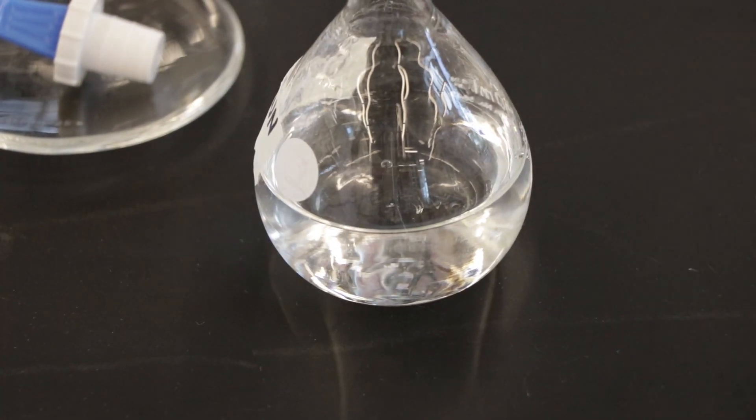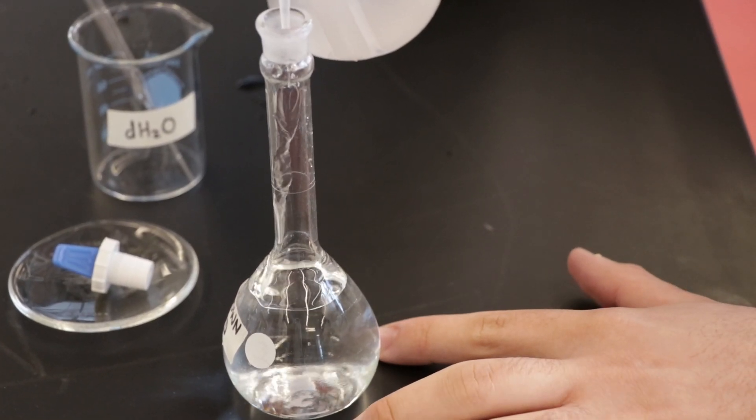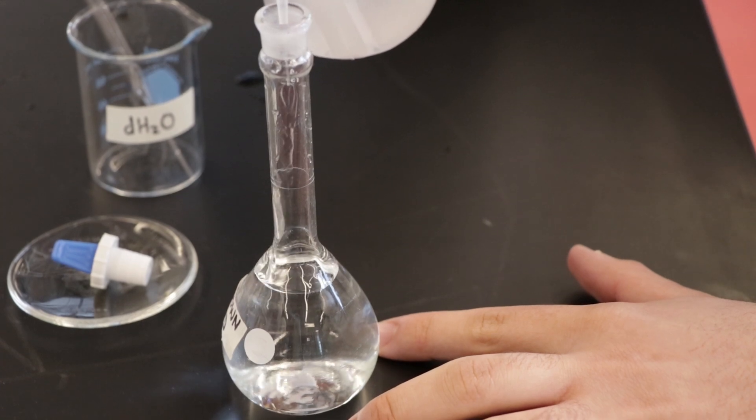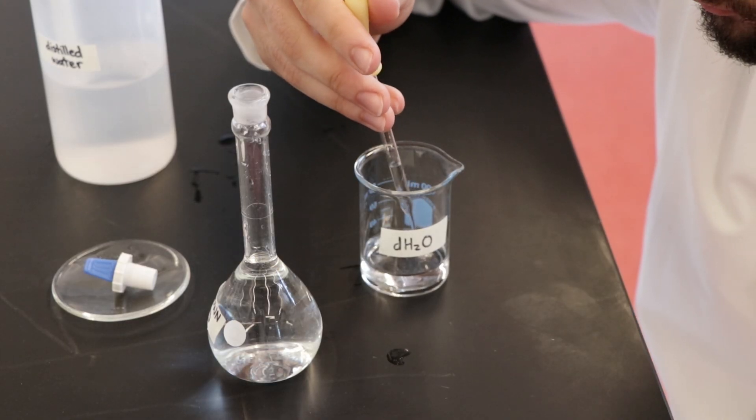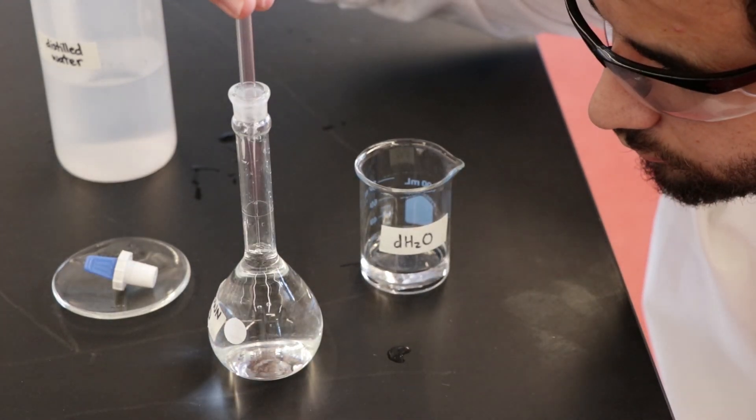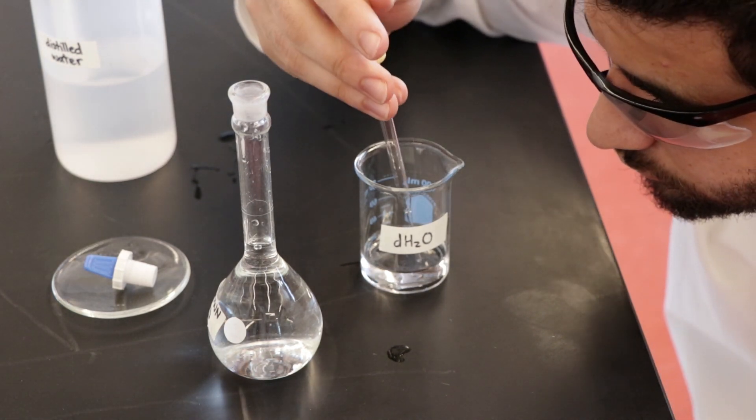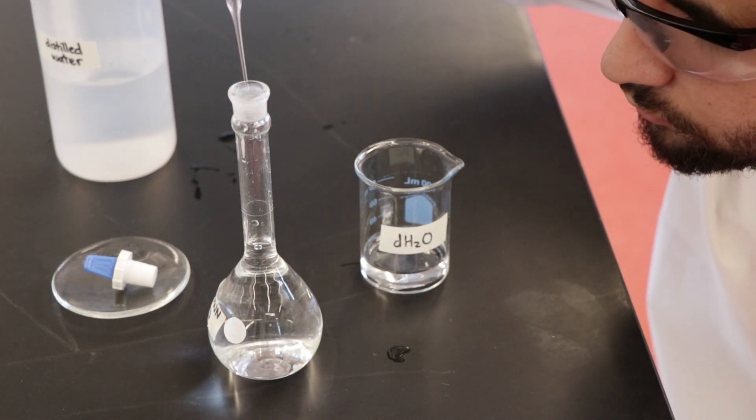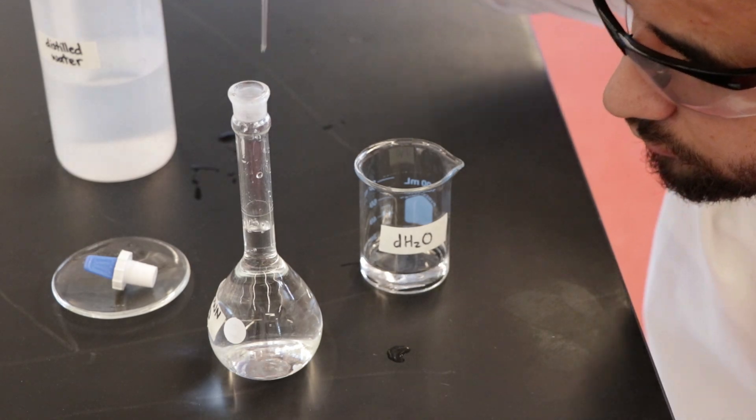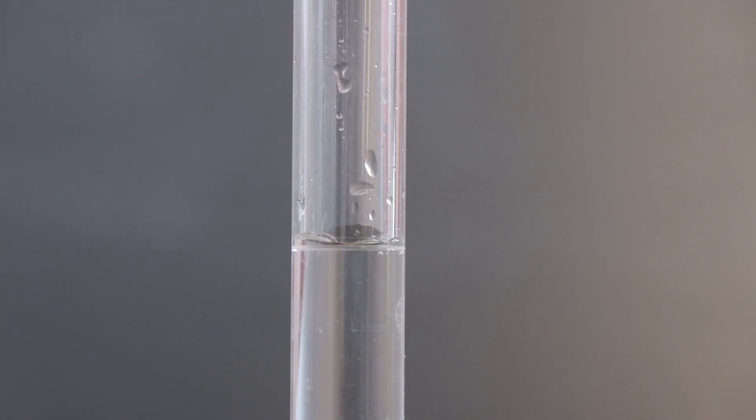Once all the solid is dissolved, fill the flask to the mark. You should use a wash bottle to add water until the bottom of the neck and then use a disposable pipette to carefully fill to the mark. Remember to be extra careful at this step. If you go over the mark, you will need to begin all over again. The bottom of the meniscus should sit on the mark.